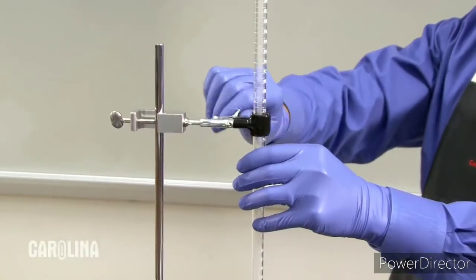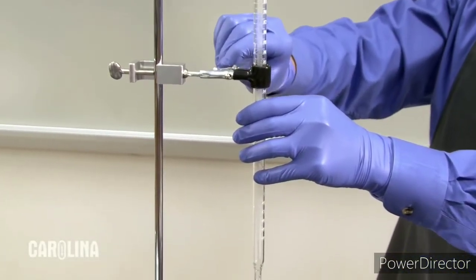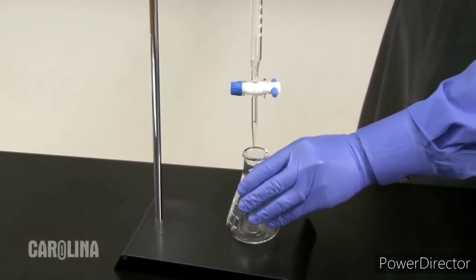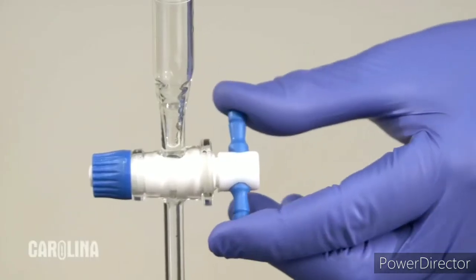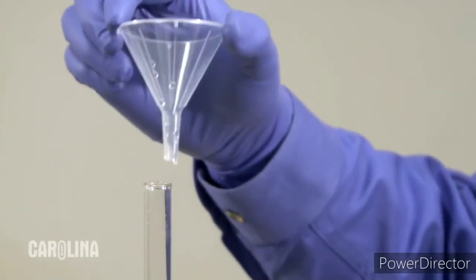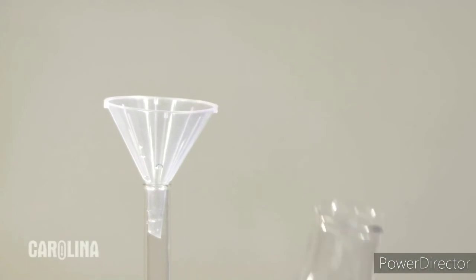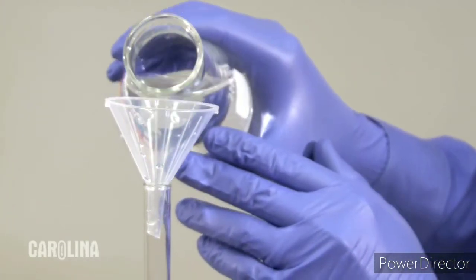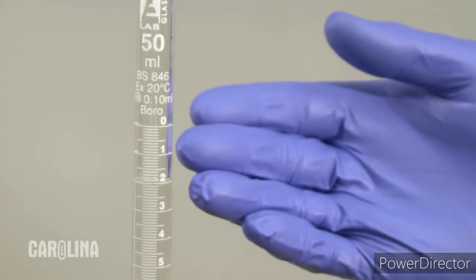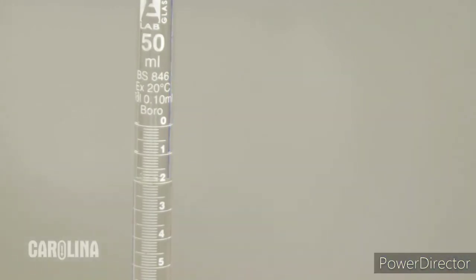Mount the burette in the clamp, making sure it is positioned vertically and there is enough room to position your flask underneath the tip. Check to see that the stopcock is in the closed position. Insert the funnel into the top of the burette and fill with titrant almost to the top. Filling exactly to the zero mark is not necessary, but you do need sufficient titrant to complete the reaction.